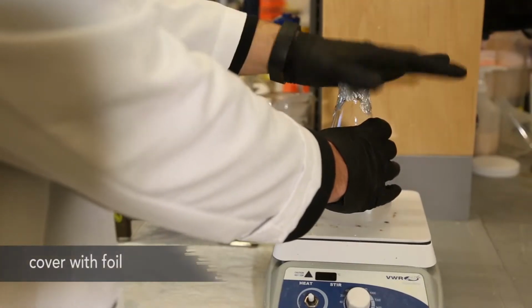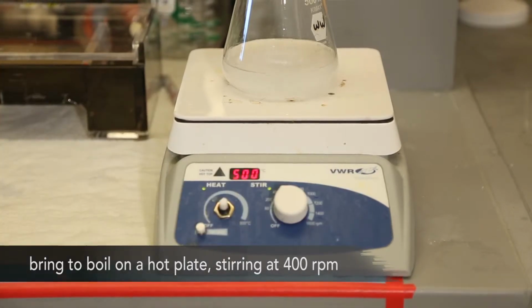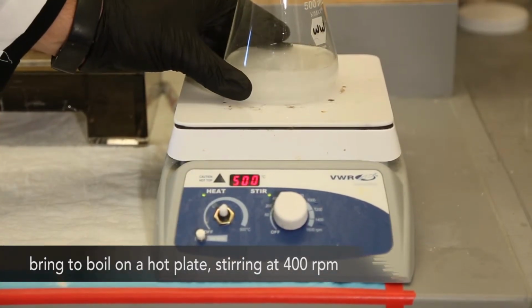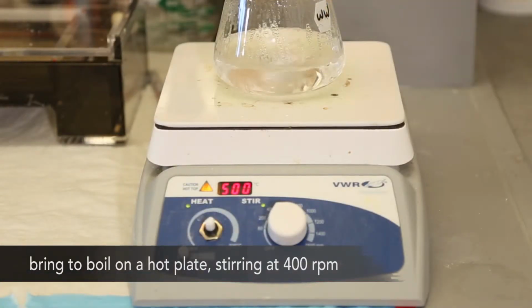Cover the top of the flask with aluminum foil to prevent vapor from escaping. Place the Erlenmeyer flask on a hot plate with stirring capability. Bring to a rolling boil while stirring at roughly 400 RPM. Allow it to boil for several seconds.